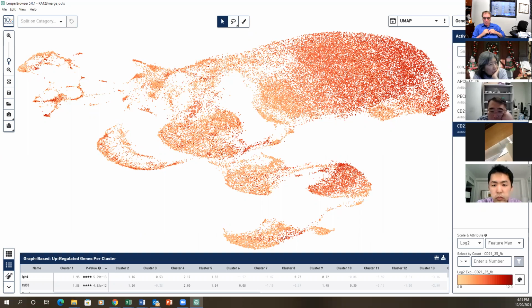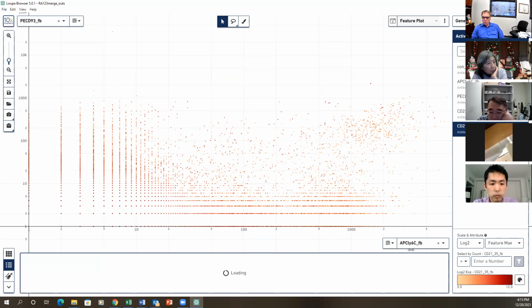So I haven't looked at this week yet. You look at this, you see the background is a big, kind of high difference though. Right. You look at the other way, you can tell which ones are real positive and negative.